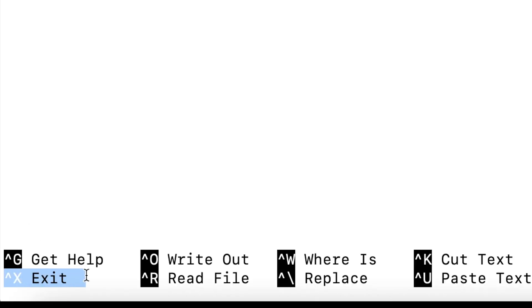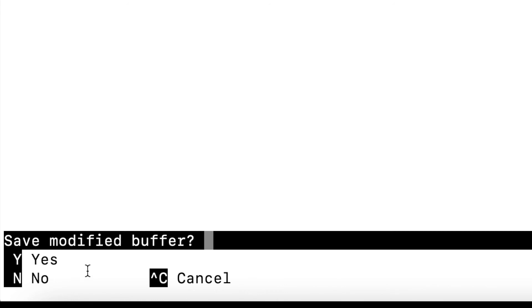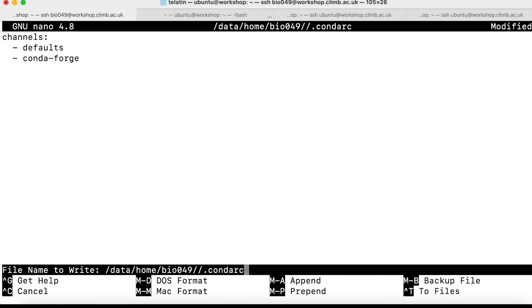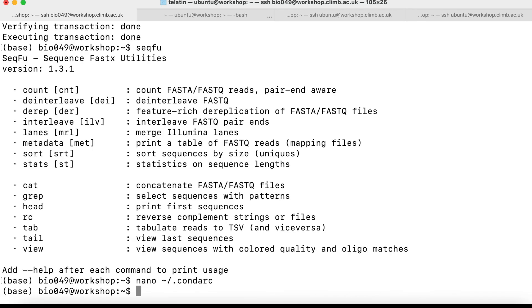It will prompt if I want to save the buffer. I can type Y for yes, and then hit enter to confirm the file name. Now, if I need again a package from conda-forge, I can just avoid typing minus C conda-forge again.